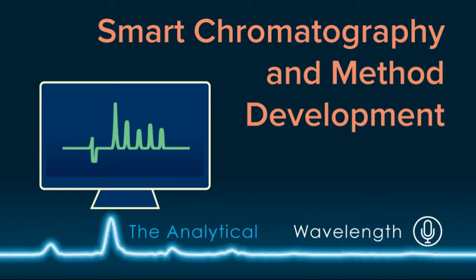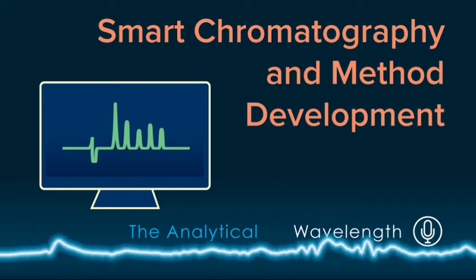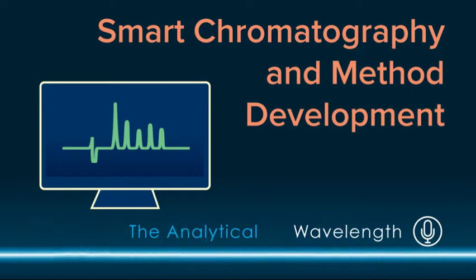Good stuff. Okay, so let's get into things. How did you get involved in computer-assisted chromatography method development? Yeah, my start with computer-assisted chromatography method development actually started in a previous company. At that point in time, I was in the lab doing a lot of small molecule method development by brute force manual method development, where I'd select columns and work my way through different columns, different mobile phase combinations, and ultimately relying on my own brain and training to arrive at the best conditions.